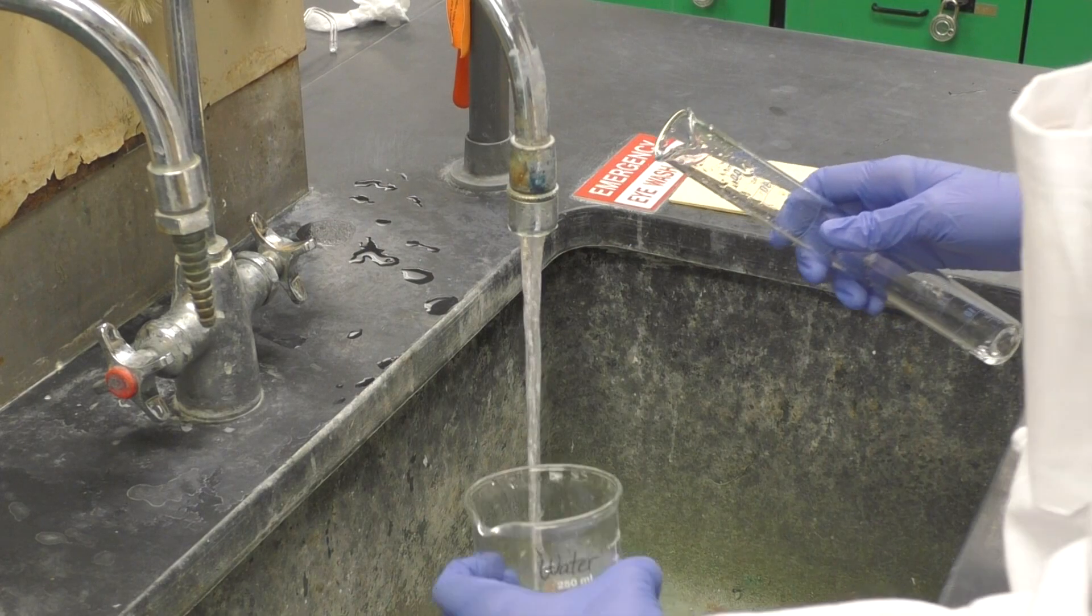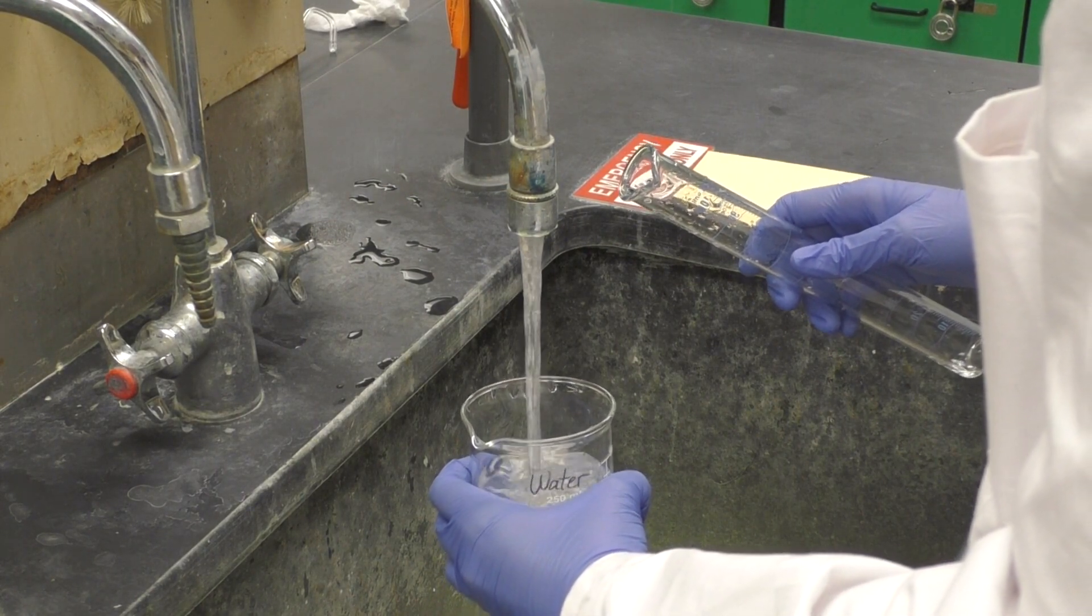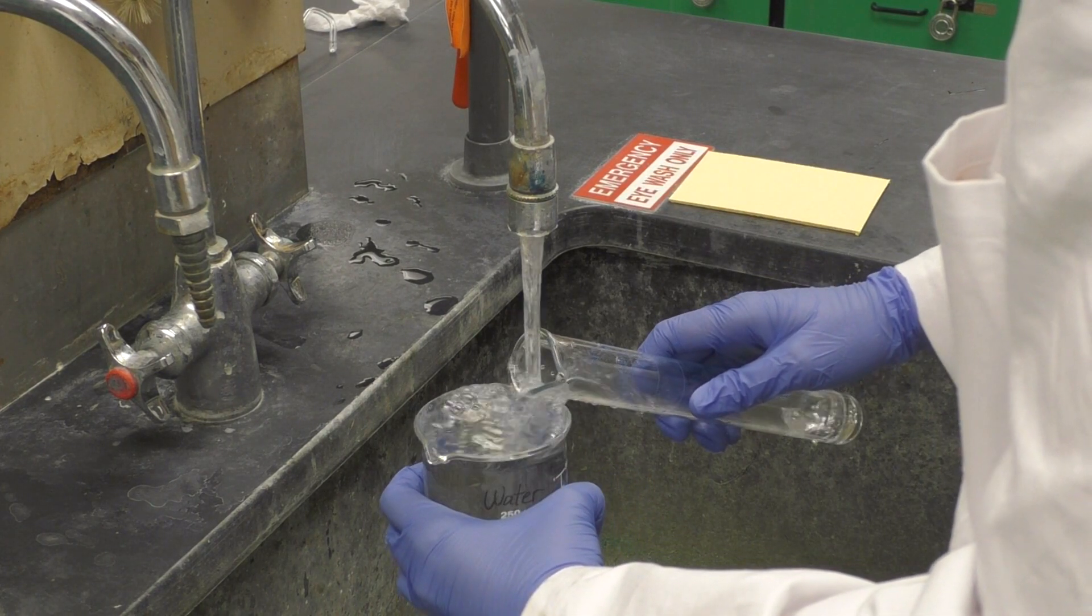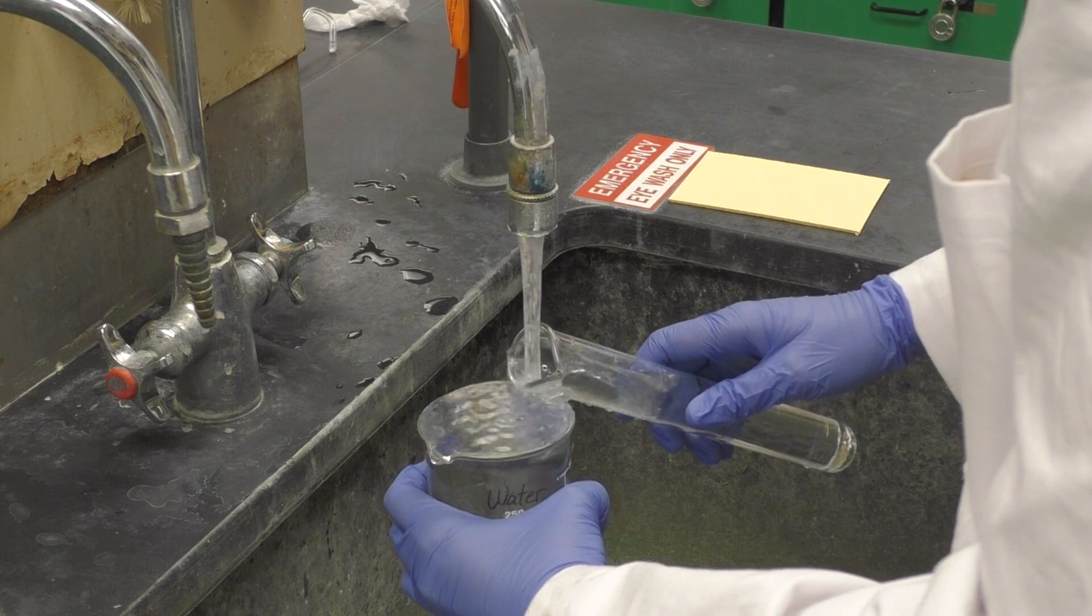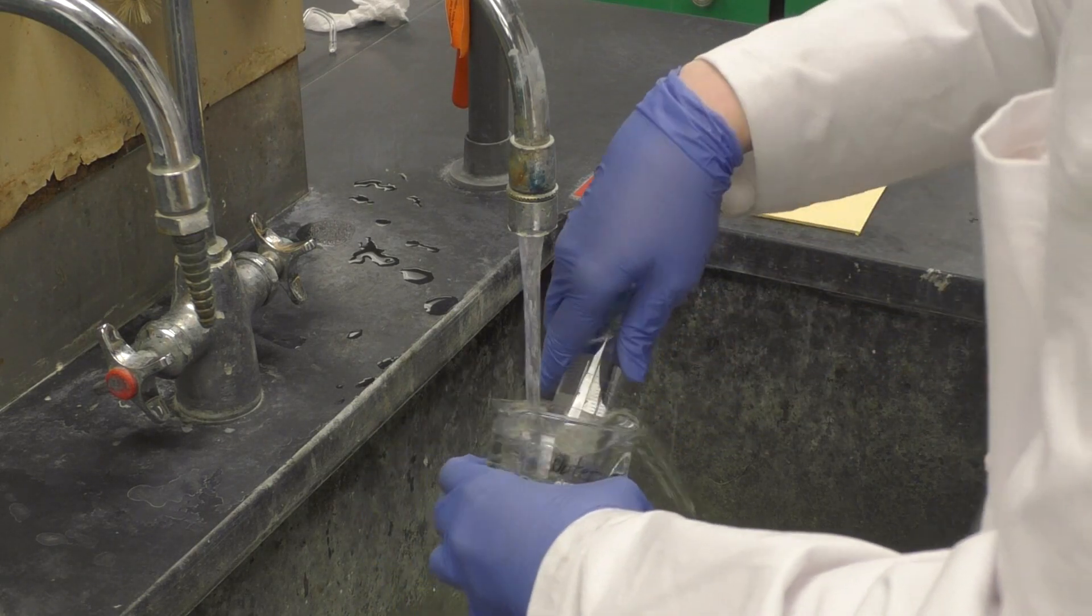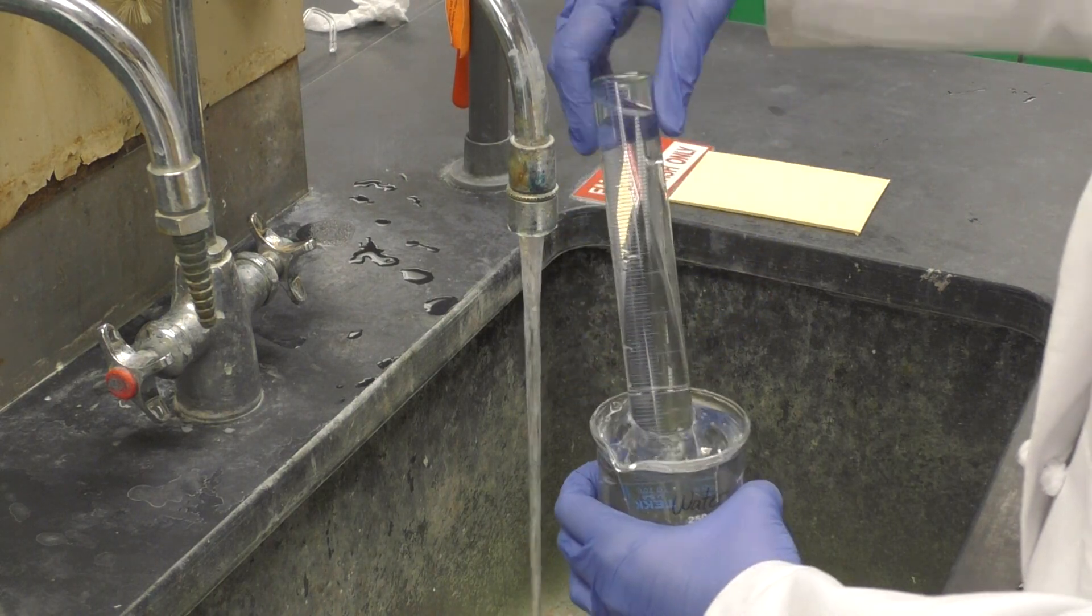First you need to fill your 250ml beaker and 100ml graduated cylinder with water, and invert the graduated cylinder into the beaker so only a small pocket of air remains at the top. This part takes practice to get right, so keep trying until you only have a small amount of air remaining in the cylinder.